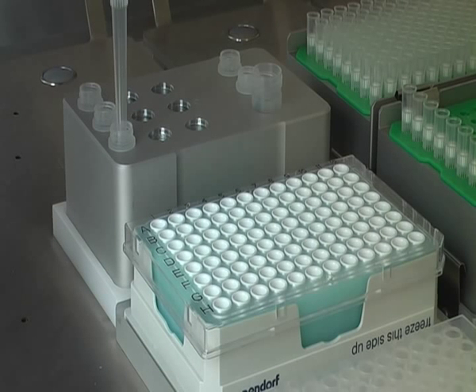Finally, the master mix is mixed by pipetting up and down and then added to the working tube, where all components are thoroughly mixed again.